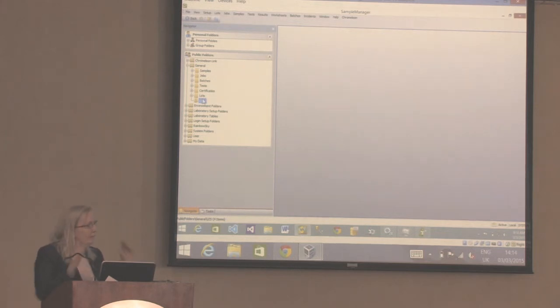Are all of the actions within the LES, the execution software, linked to the user logged in at that particular time? Yes. So it's recording the user who performs that step and the time they perform the step. All of that is recorded in the execution history, so you can review that at any time.